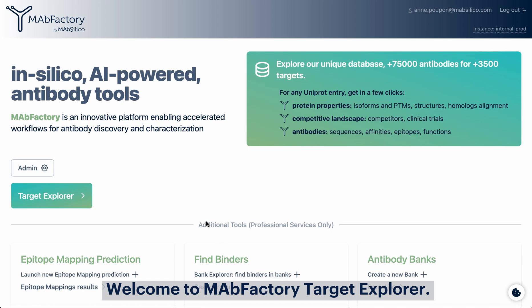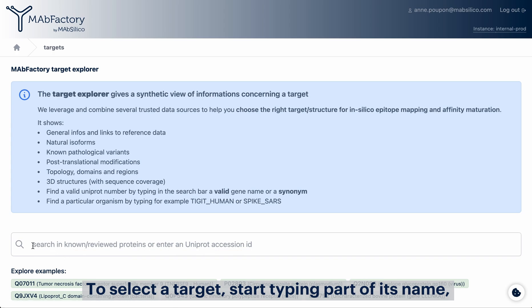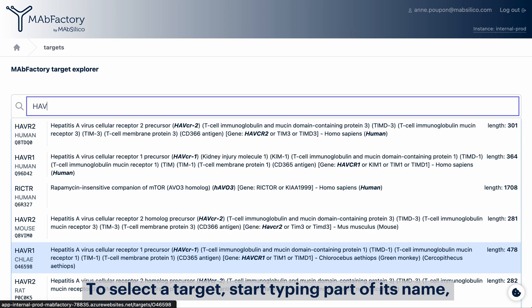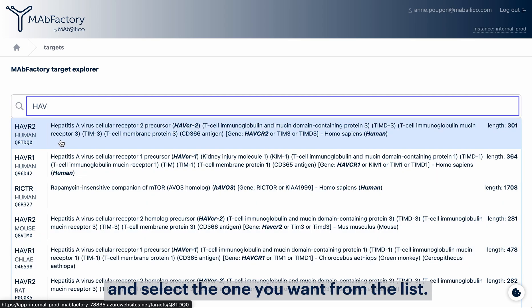Welcome to MapFactory Target Explorer. Our unique database contains more than 75,000 manually annotated antibodies. To select a target, start typing part of its name and select the one you want from the list.